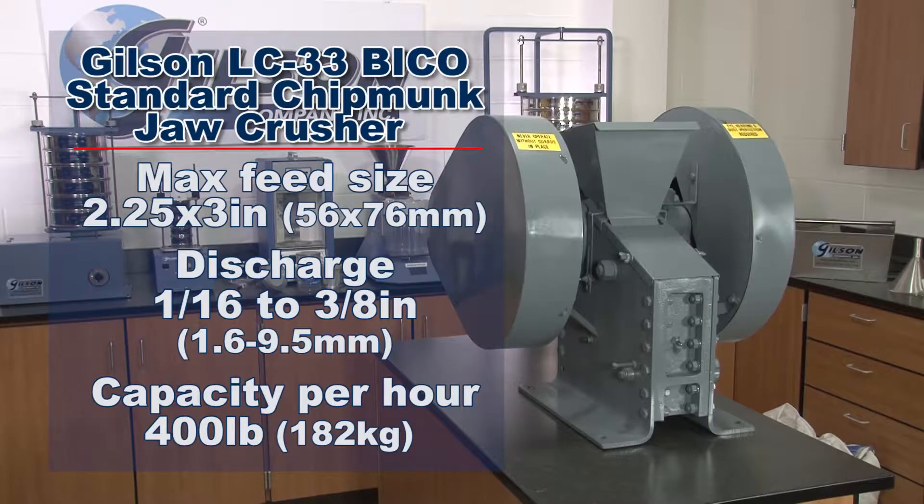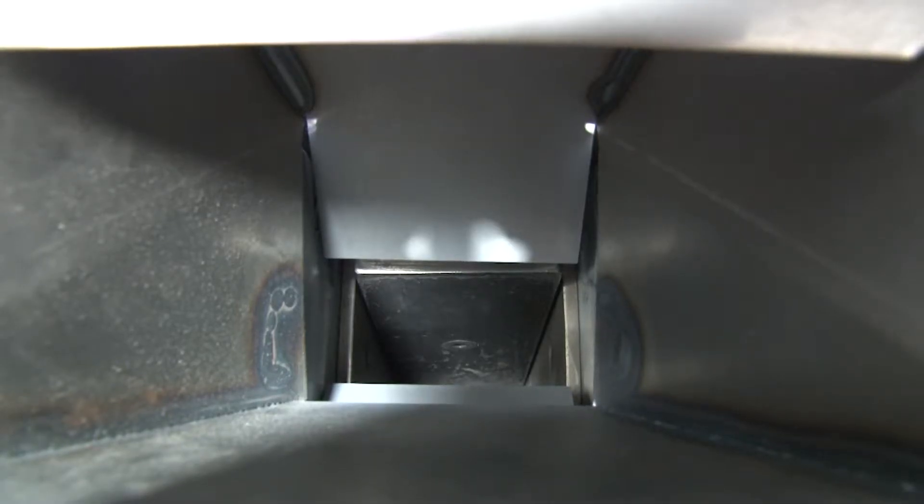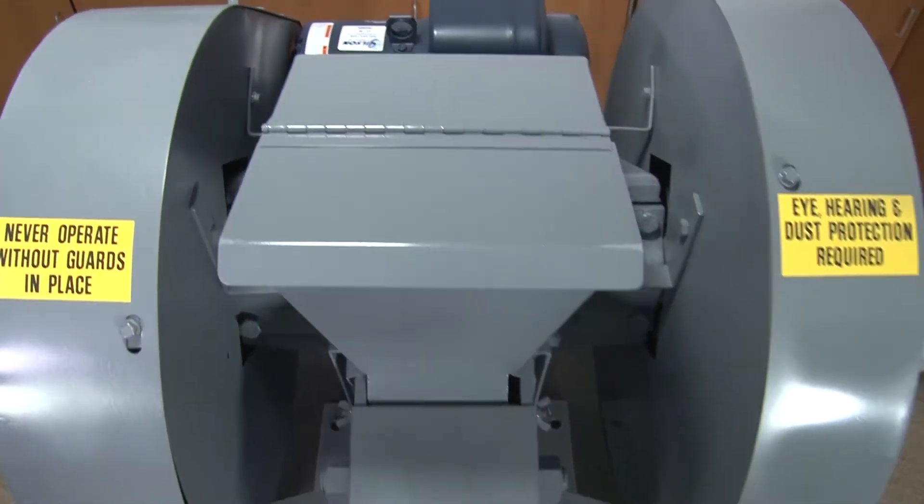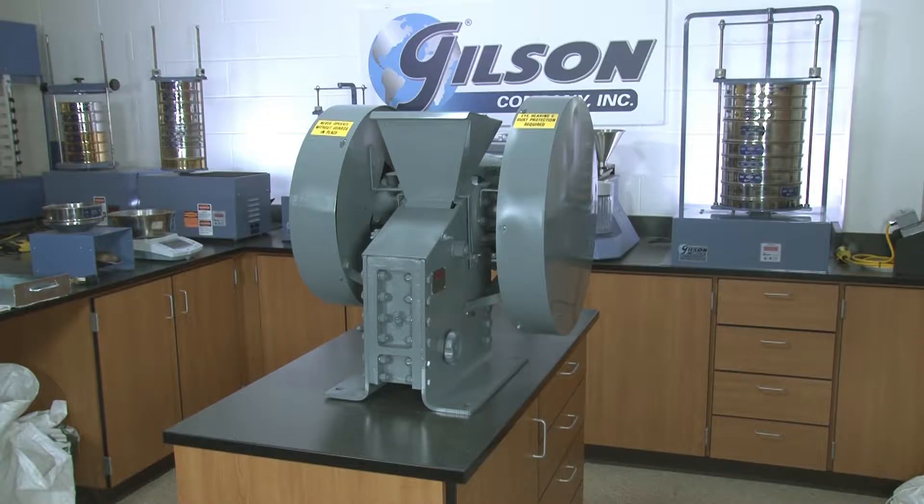Like the Gilson LC33 BICO standard chipmunk jaw crusher, with its exceptional crushing capacity and resilient user-adjusted jaw action causing forward and downward motion crushing the sample, enforcing its discharge for controlled particle sizing.